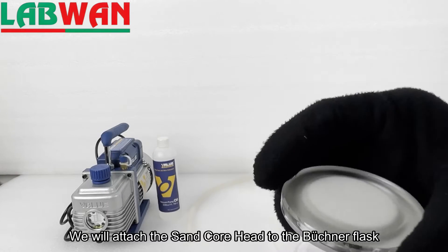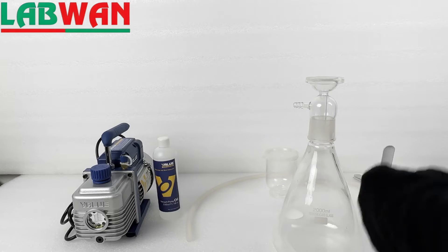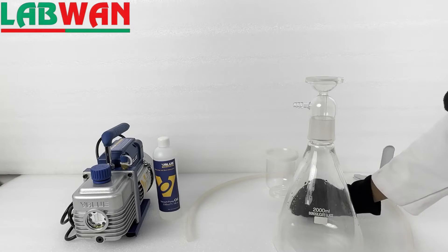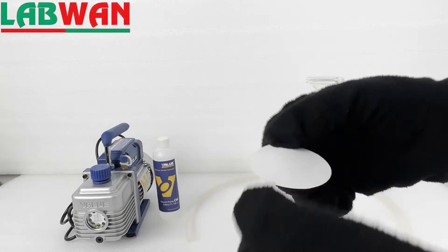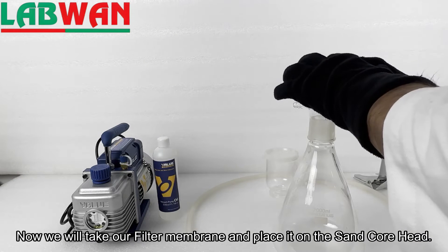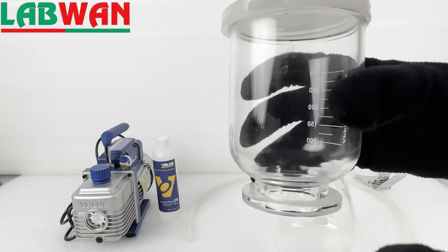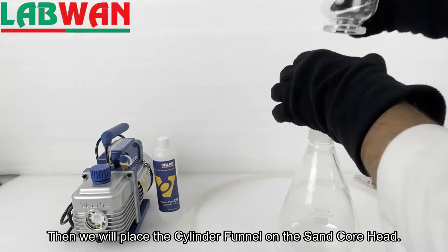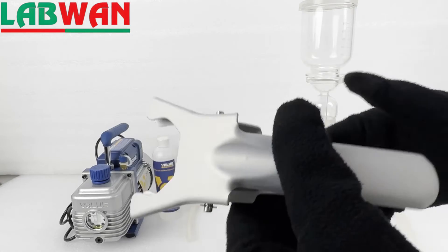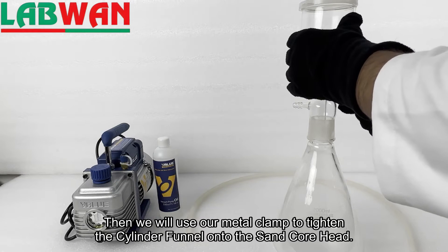We will attach the sand core head to the Buchner flask. Now we will take our filter membrane and place it on the sand core head. Then we will place the cylinder funnel on the sand core head, and use our metal clamp to tighten the cylinder funnel onto the sand core head.